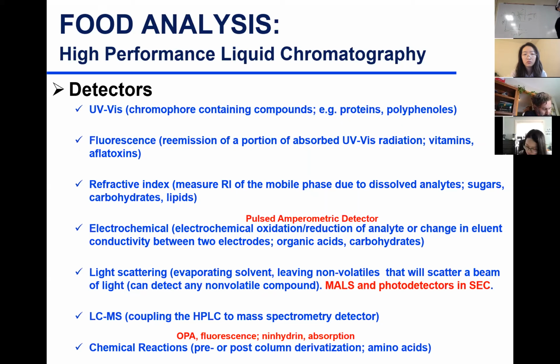But what it means is when a component absorbs light, it can fluoresce the light. When the component absorbs light, it goes to an excited state. And as it goes back down to the ground state, it emits light. But the light emitted is of a longer wavelength, less energy, because some of the energy is dissipated as heat. Don't worry about all of this, we'll cover it next week.